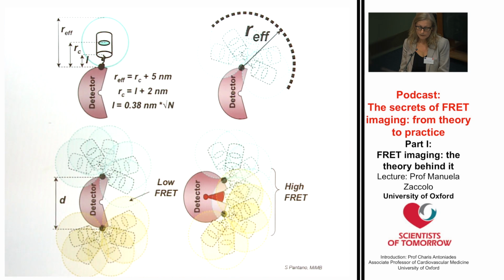So in most cases, the choice of the distance is very limited. But if one makes these very simple geometrical considerations on distance, and has in mind a specific domain that is intended to be used as the detector, then one can, with some good approximation, get an idea if the sensor has any chance to work or not.